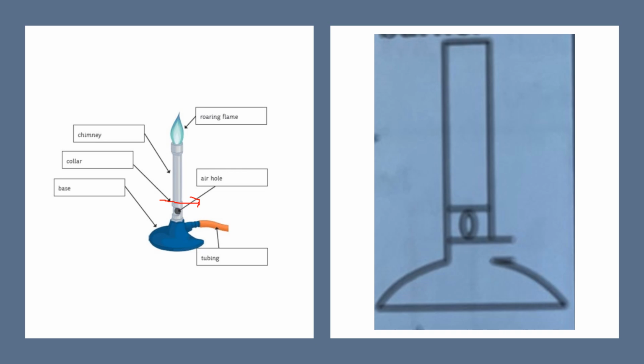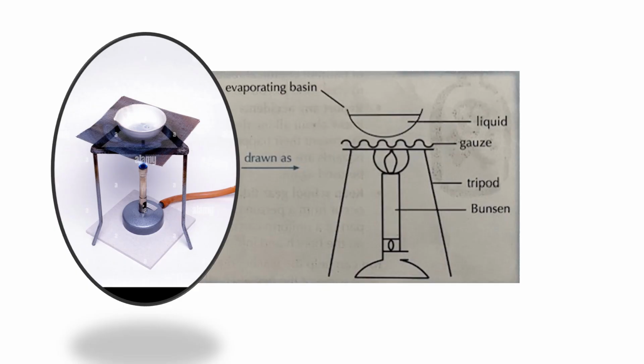And the Bunsen burner you can draw in the laboratory book like this. See, even in the sketch you are showing all the necessary items. The air hole is an important part of the Bunsen burner drawing. Or you use an upright arrow for the heat.